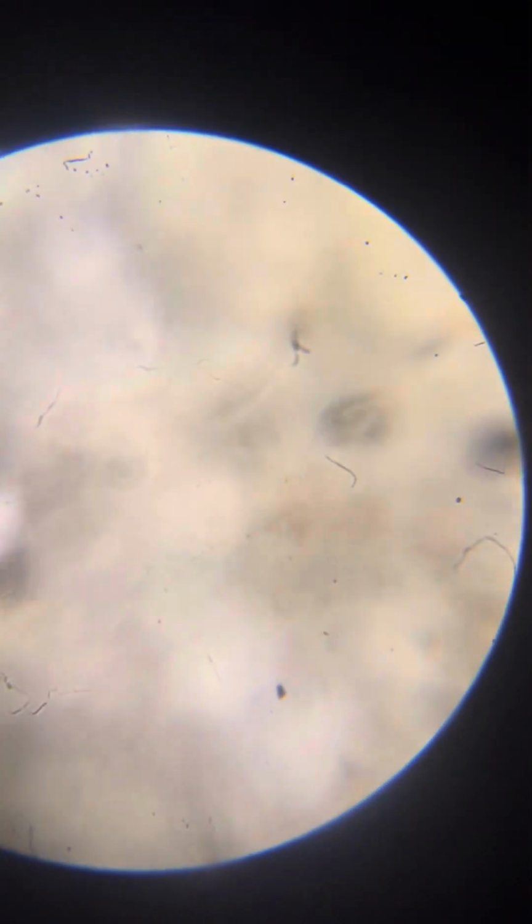This is a very fat one. In the very fat ones, you see the white line in half the width. Again, since we have so much to see, I will do it relatively hastily. We see Neros, bigger, not huge but somewhat big, and we see smaller ones. So I'm satisfied. Less than what we've seen in the other slide, but this is natural, because it's a descendant container, so it makes sense. So we see much less, but we do see Neros.